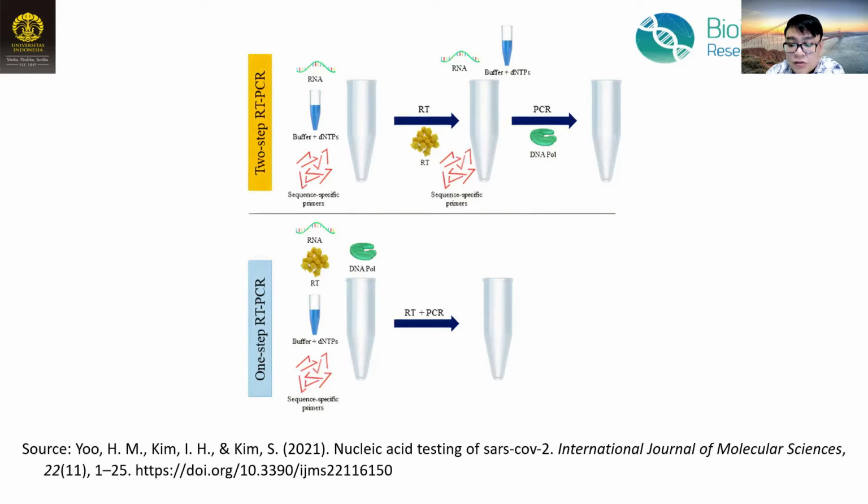The primer used to detect SARS-CoV-2 is different in each country. In the UK, the primers used in RT-PCR target S, N, and open reading frame 1ab. And in Jakarta, the primers used in RT-PCR target N, E, and RdRp.